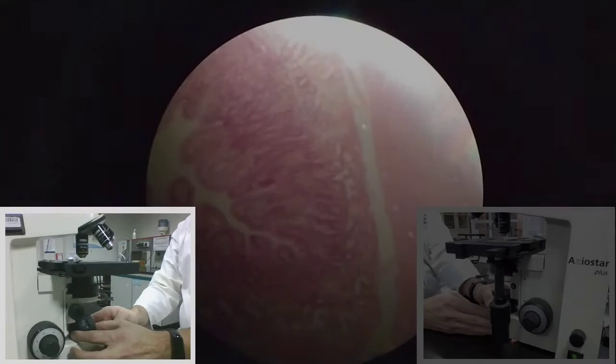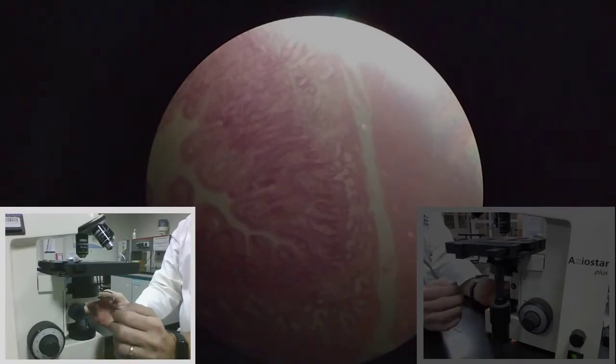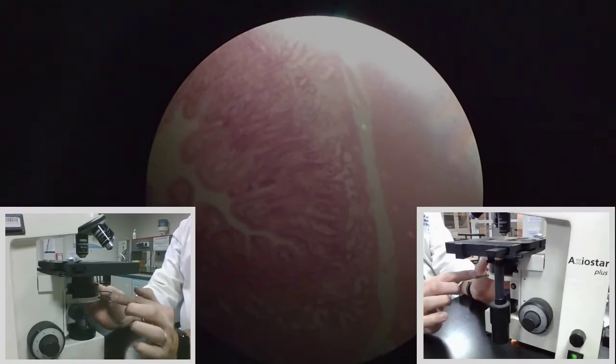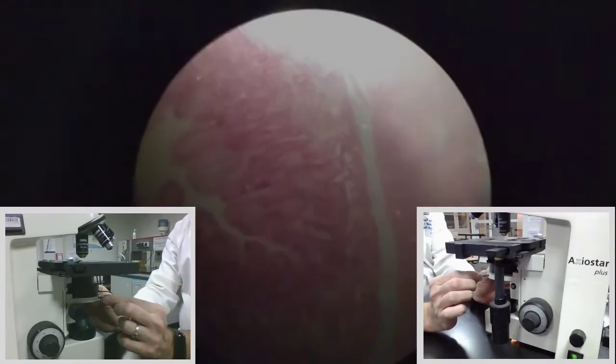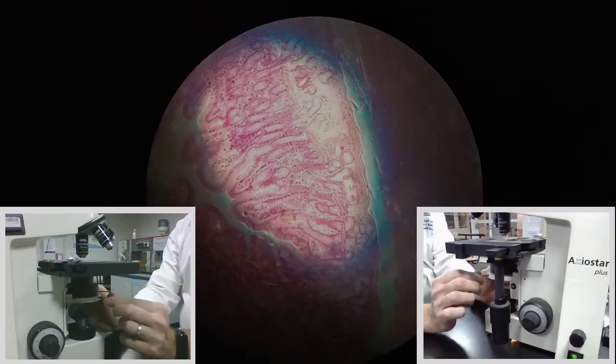As I close it completely, I can see there's a bit of light at the top edge of my field of view, but that's about it. I need to put that spot of light a little closer to the middle. In order to do that, I'm going to use these two screws — these are the centering controls for the condenser — and start turning them until I see that bit of light coming closer towards the middle.